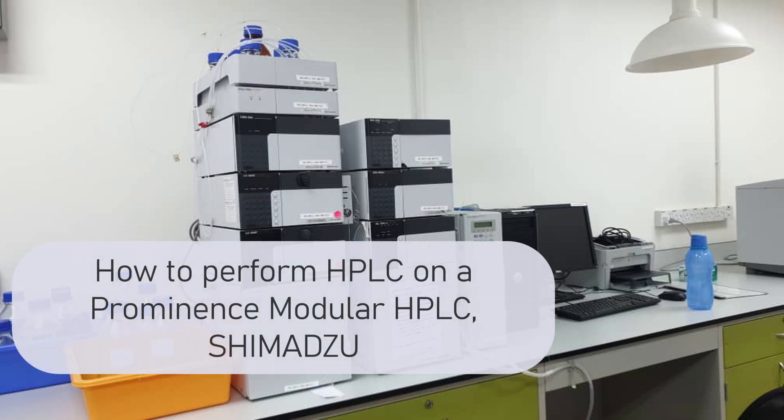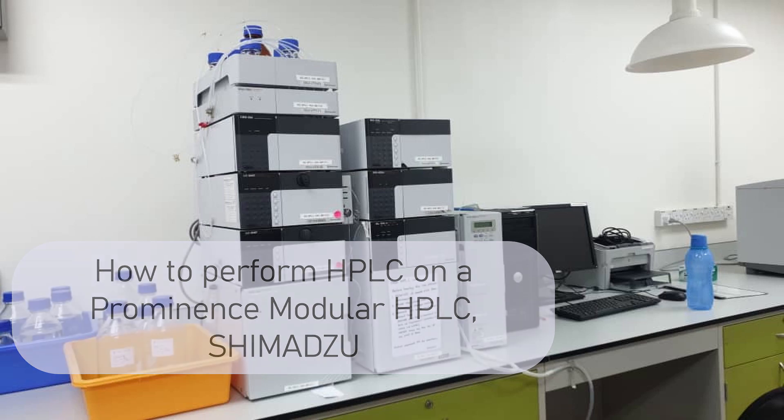Hi! In this video, we would like to show how to perform HPLC on the Prominence Modular HPLC SHIMADZU.